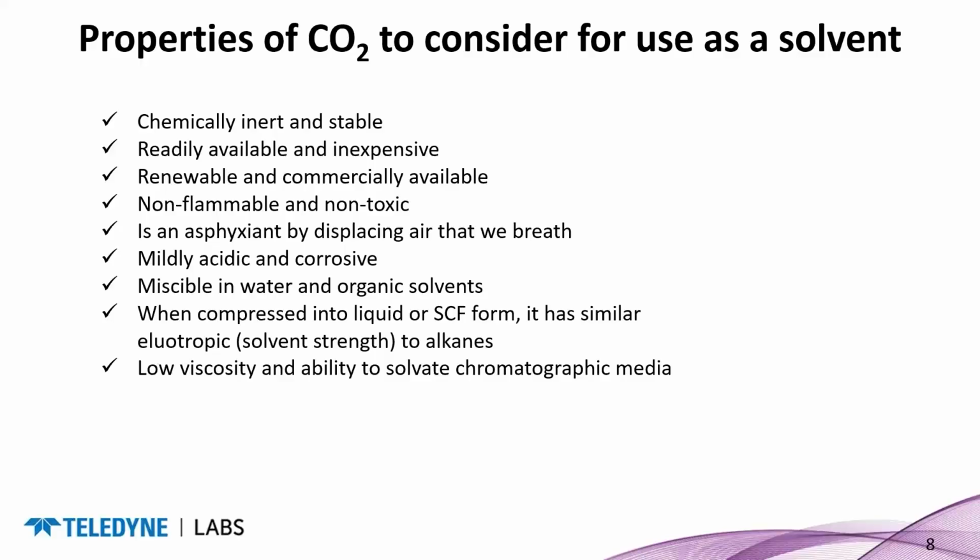It is mildly acidic and corrosive, however we can turn the acidity into an advantage, and that actually is beneficial with some of the acidic molecules that we're trying to purify. You may not need to use a modifier, and we'll go into more detail later.